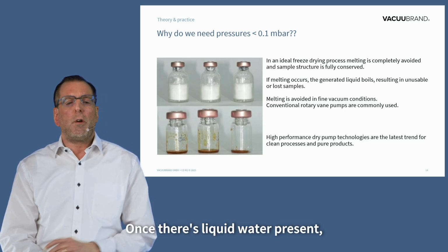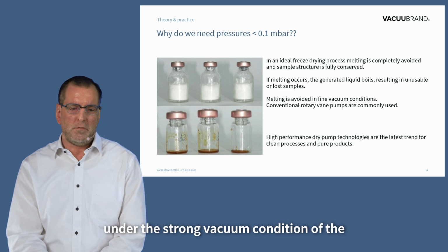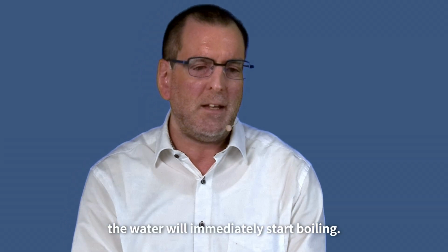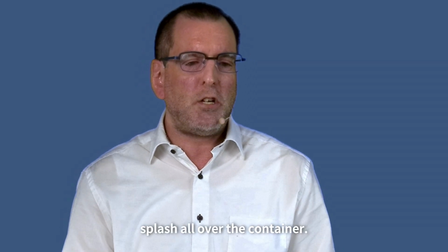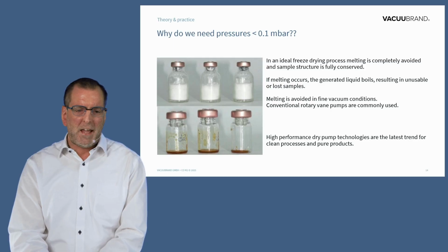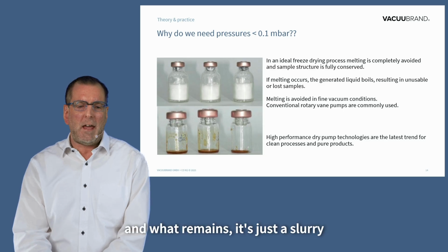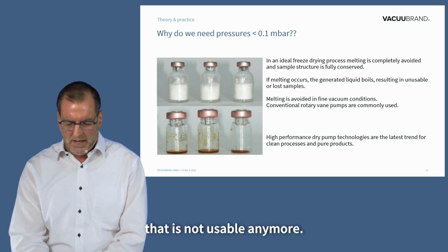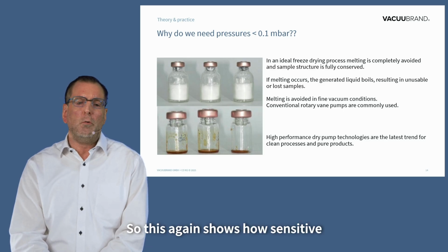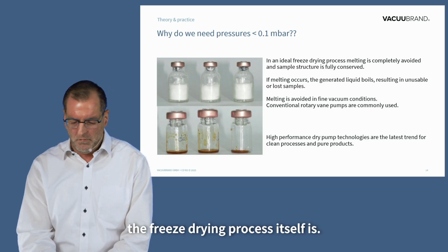Once there's liquid water present, under the strong vacuum condition of the freeze drying system, the water will immediately start boiling. You will see bumping retardation, which leads the sample to splash all over the container. And at the end of the day, the sample is basically destroyed, and what remains is just a slurry that is not usable anymore. So this again shows how sensitive the freeze drying process itself is.